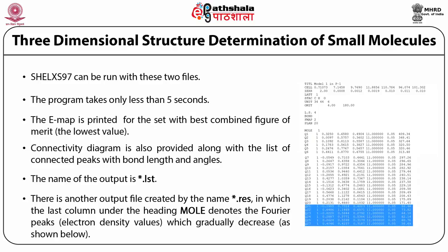Then it has found the fractional coordinates, because these coordinates are usually less than 1 and some positions are greater than 1. I already told you what it means for an atom to have a fractional coordinate greater than 1. It has peeped into the next unit cell along the direction, and to compensate, another atom will peep into the unit cell. So that's it.